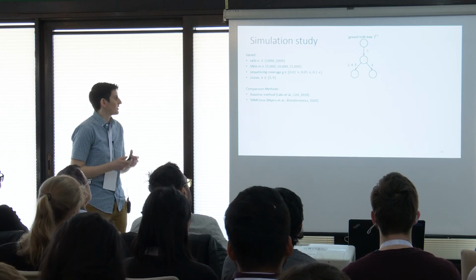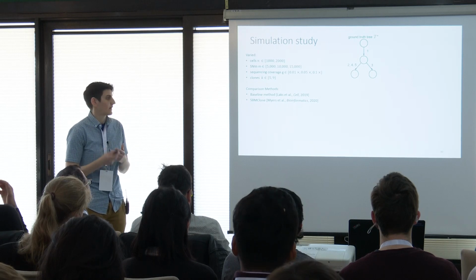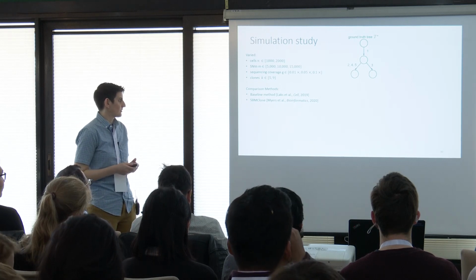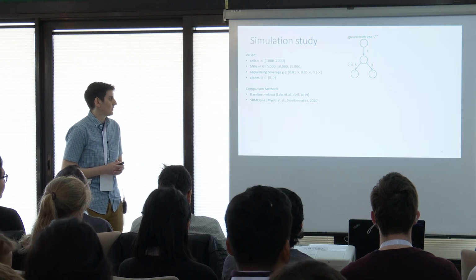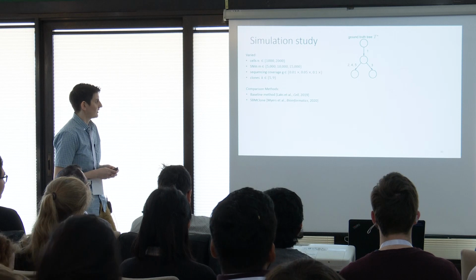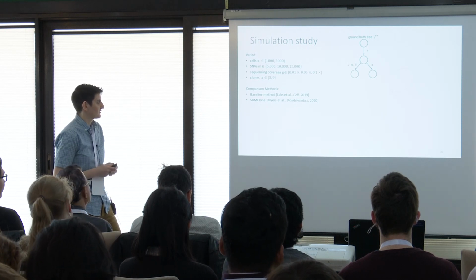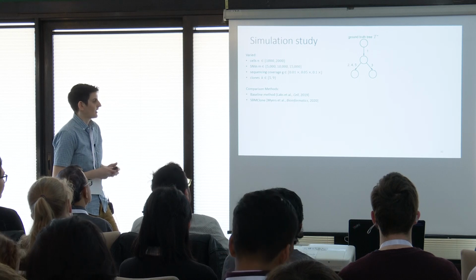In addition, we compared against some other existing methods, including the ad hoc baseline method that I described earlier, and SBMClone, which does joint clustering of cells and SNVs using a stochastic block model. We paired both of these methods with an existing tree inference method, SiCloneFit, to more directly compare against Phertilizer.